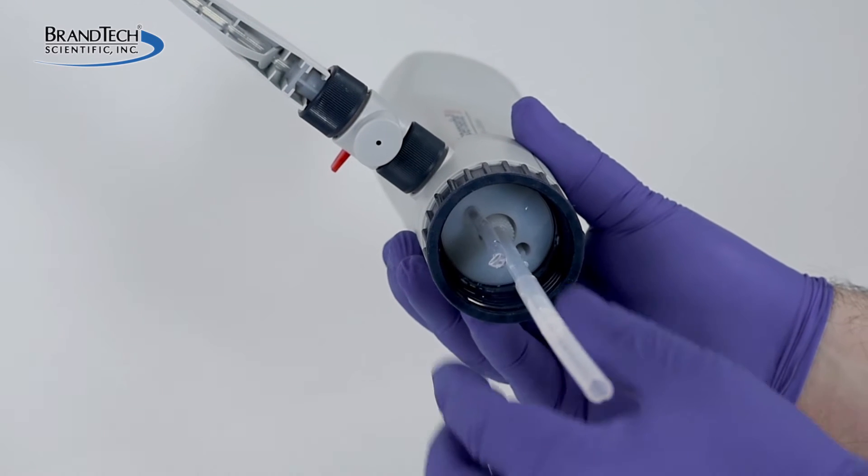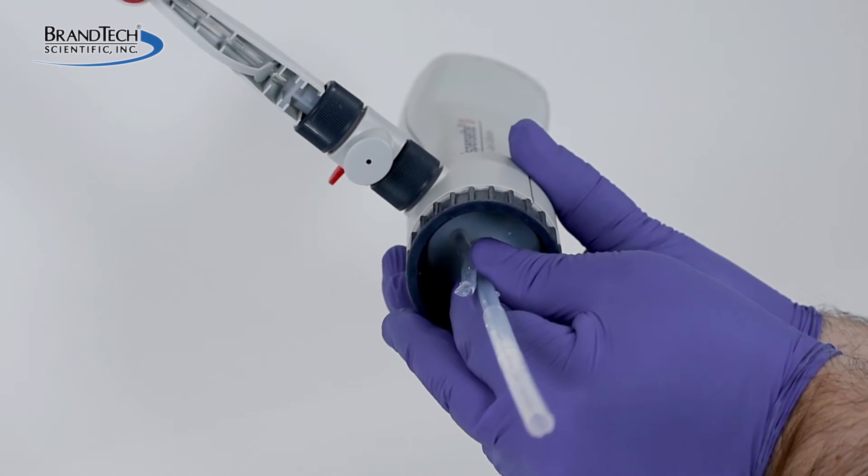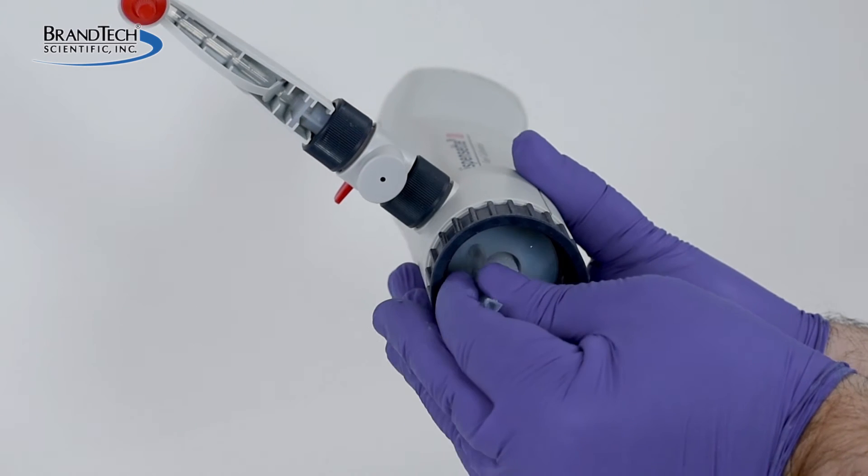Remove the Dispenset from the bottle and pull out the filling and recirculation tube. Now remove the piston from the instrument.